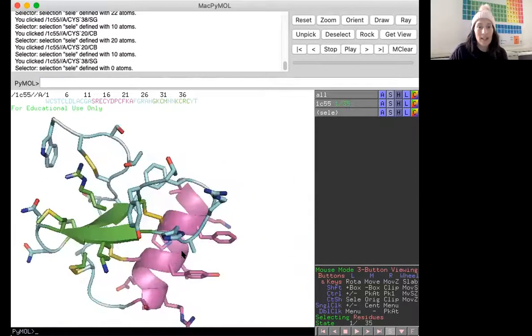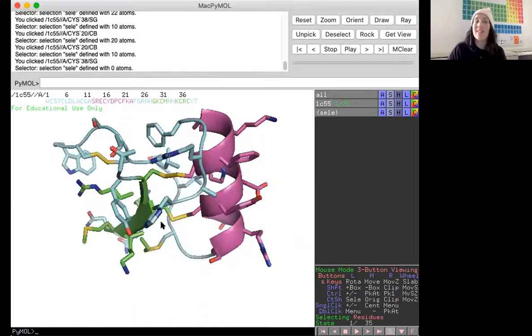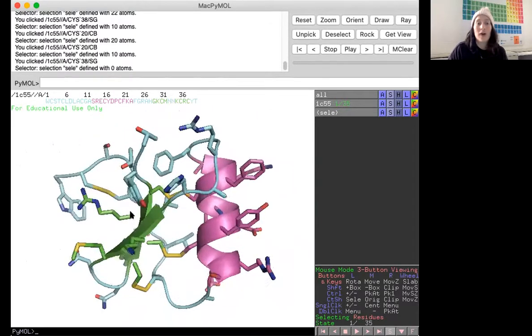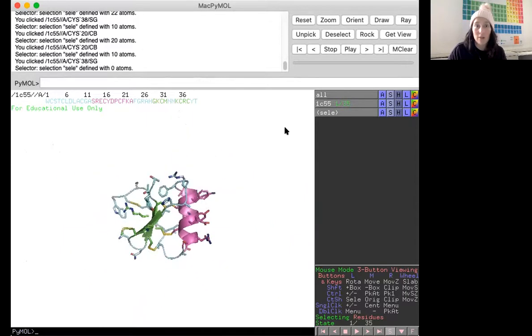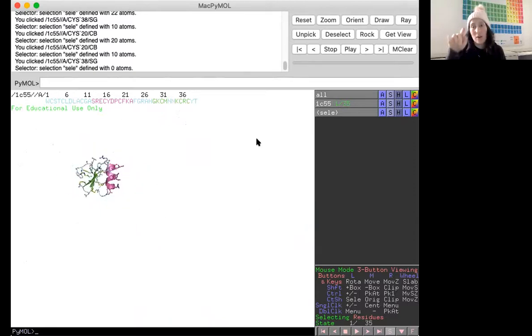All right, so really the intent of the quiz is just to get you playing around with PyMOL and then uploading some images. So let's say this was one of the images that I'm asking you to upload. I would try to center it, make it look great. Here's an example of something that looks terrible: if you do something like this and take a big picture of all that, because whatever's in this whole display box is what the image is going to save.